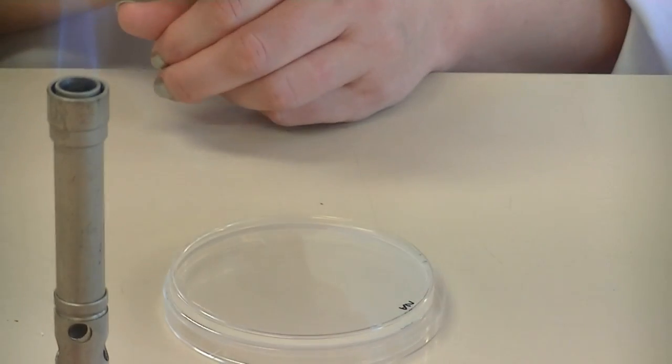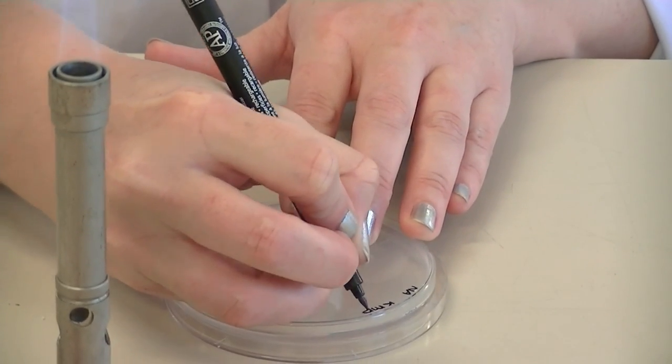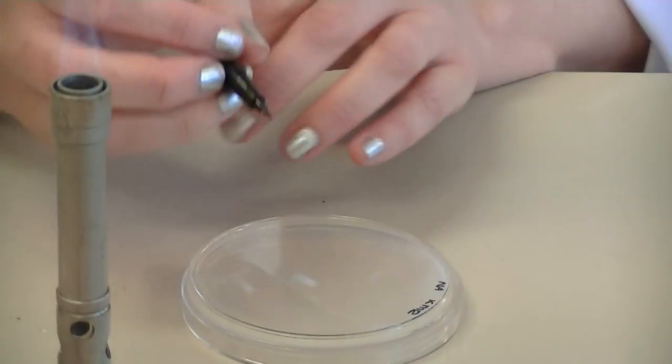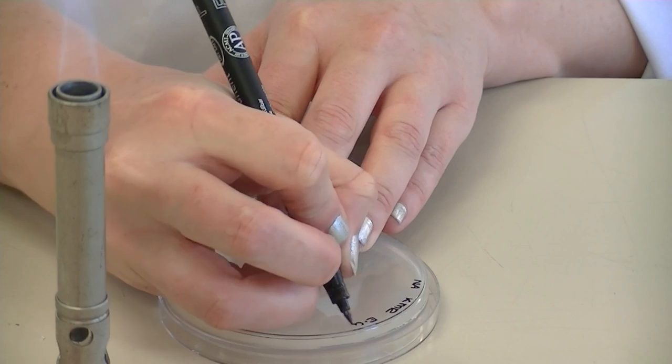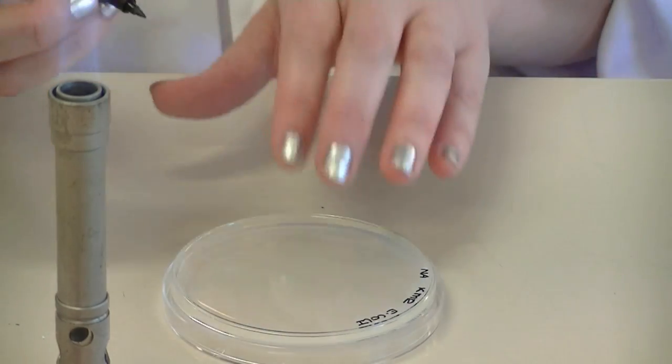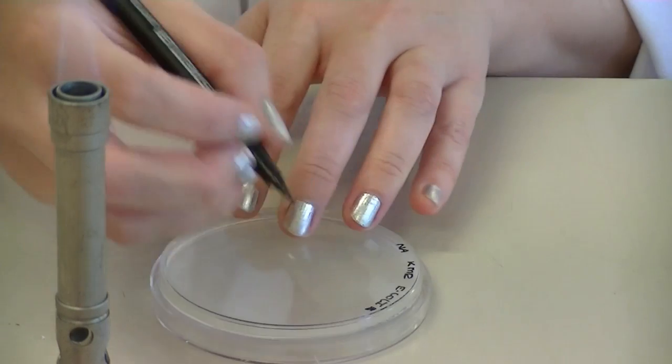Write the abbreviation N-A. Include the initials from your first name, your middle name, and your last name, and then the exercise number or the organism. I'm going to write E. coli B so I know it's from the broth. And also include the date.